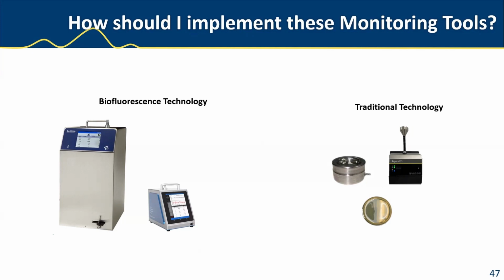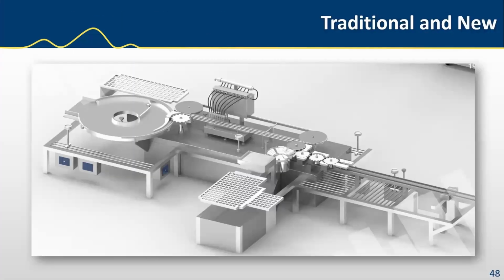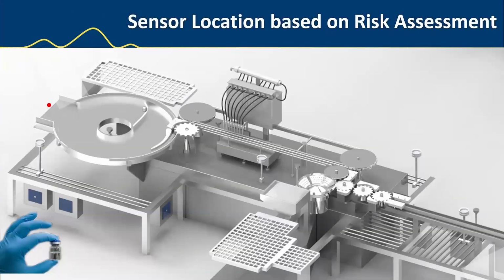It could be implemented in isolators away from human activity, as long as you're loading your sample media in the same environment that you're testing, same grade of environment. So it may mean purchasing a small lab cabinet to put it into. And then you've also got to contend with the particle losses in sample tubing if your tubing run is too long because of the size of the equipment. The MicronView model down here is smaller, but it doesn't capture the actual sample. So again, you've still got the issues with false positives to contend with. Something that you can live with or not, I'm not sure, particularly when you're looking for zero CFUs in your process.